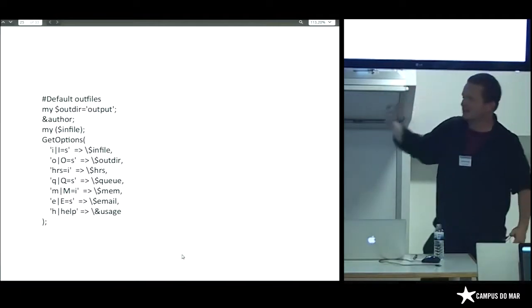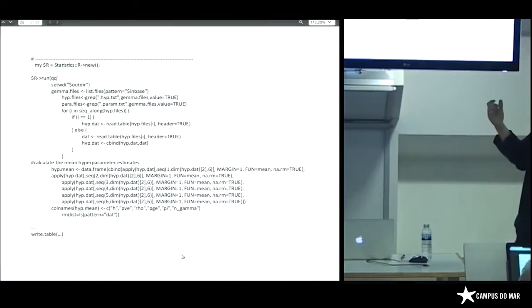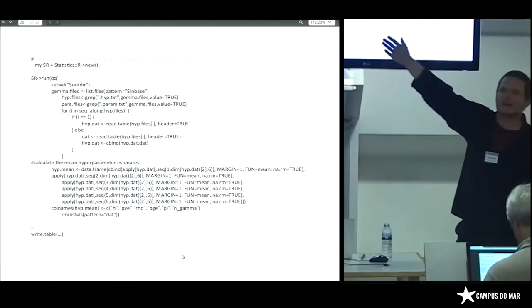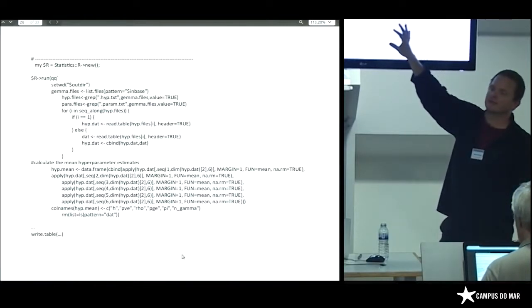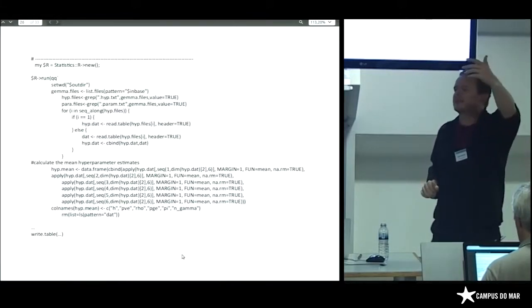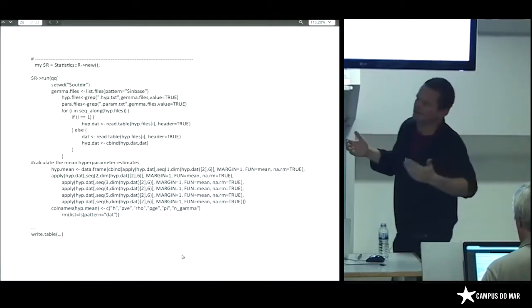And we tell it to get some other information, and then it actually calls R from inside the script. You have a copy of this PDF now, so you can read for yourselves exactly what this script is doing, but it's basically doing a whole bunch of matrix manipulation and saying, okay, we had all of these estimates, let's combine these 5 together, what's the mean, and can we calculate a 95% credible interval around all of those mean parameters?